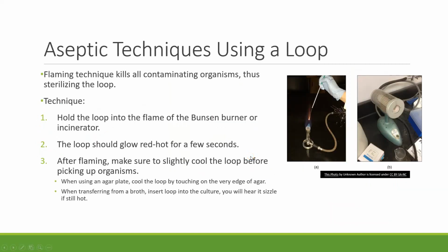So, how do we maintain aseptic techniques when we're working in the labs? Before we talk about transfer, we're just going to talk about a couple of steps first. So, aseptic techniques using that inoculating loop. Again, we're talking about a metal inoculating loop that we would use multiple times.